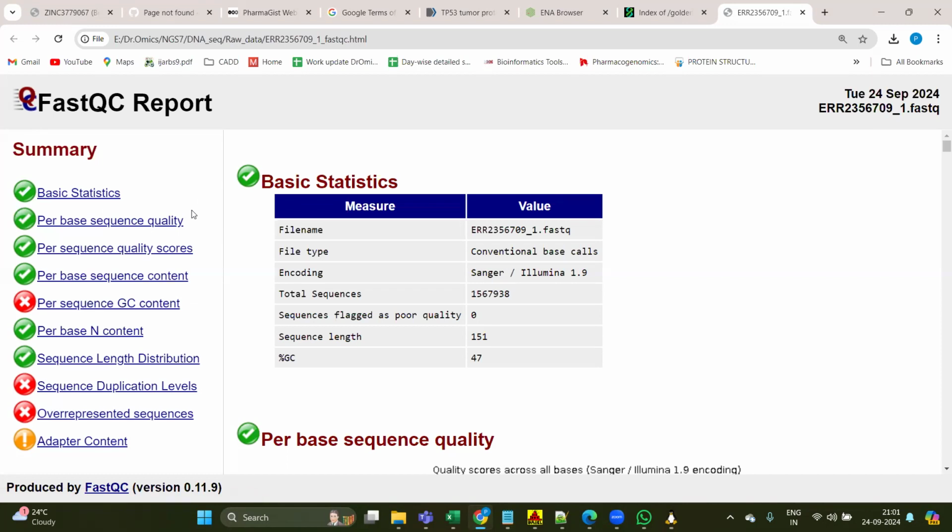Even though we have only three most important parameters, the second one and the last two, we are still going to discuss each and every parameter in detail tomorrow. So till here, if anybody has any kind of doubts, you can ask me now.